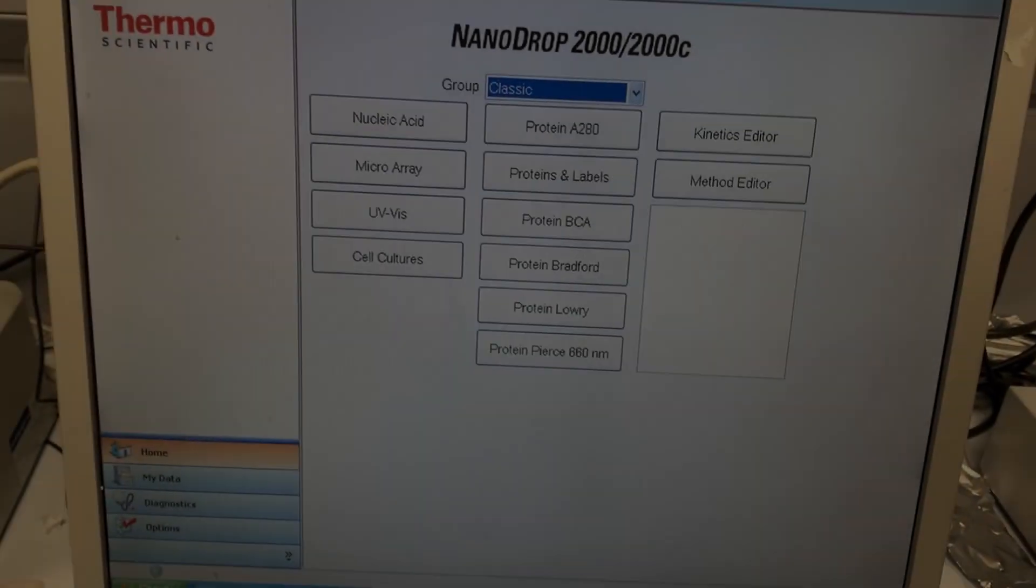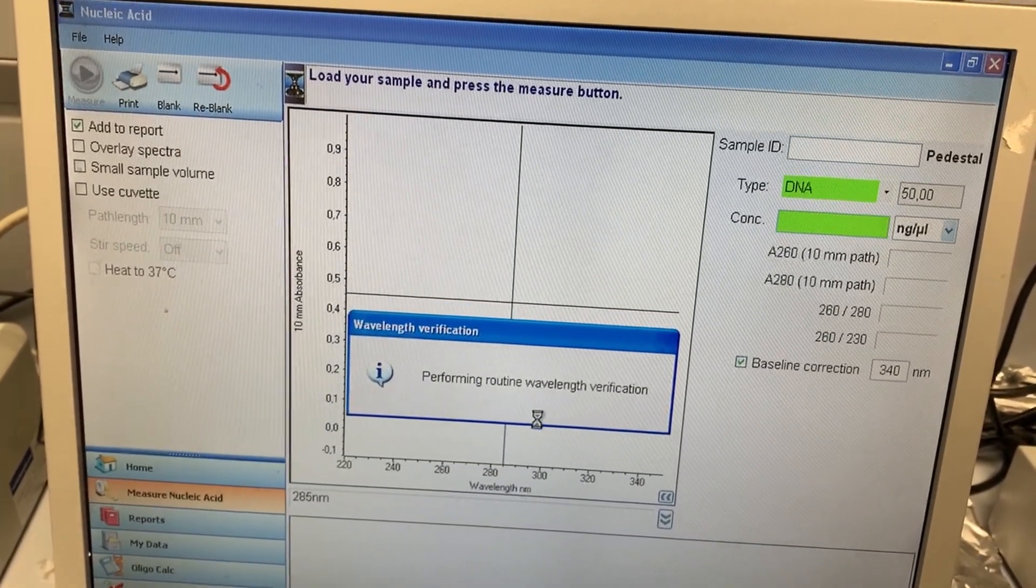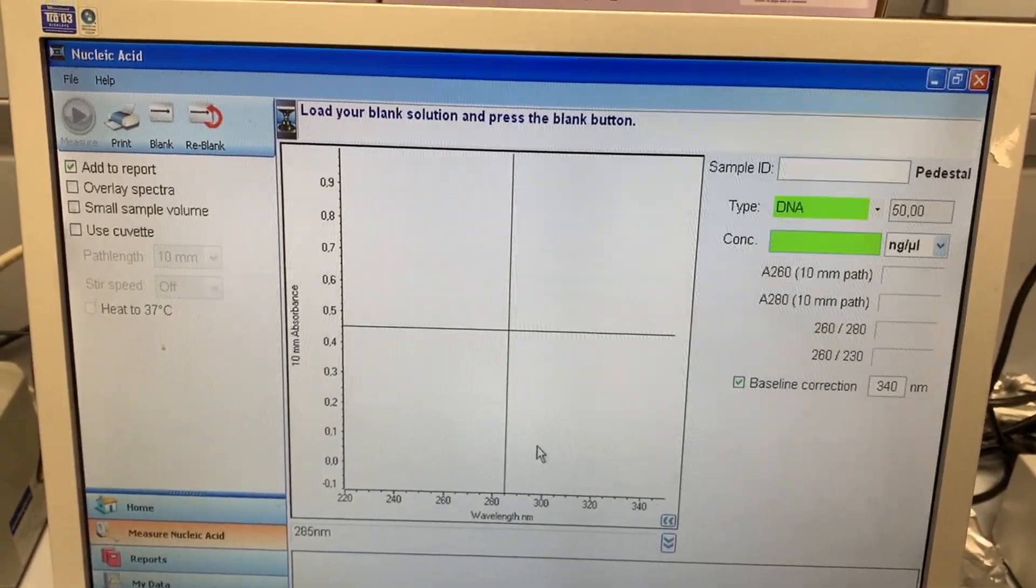First of all, you have to open the Nanotrop program and select nucleic acid. Make sure to select DNA. And then the machine will ask you to blank.